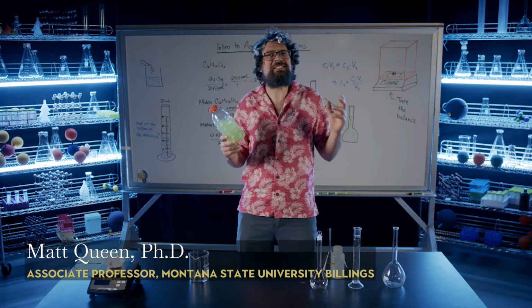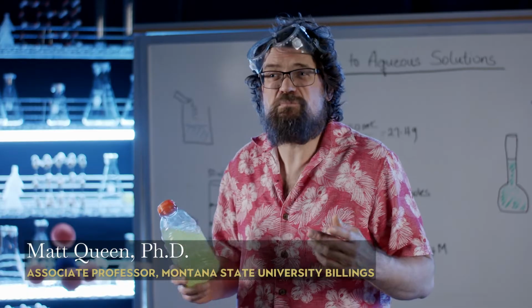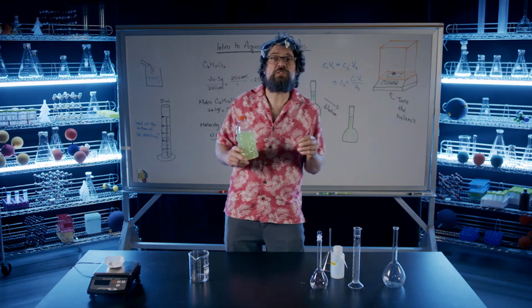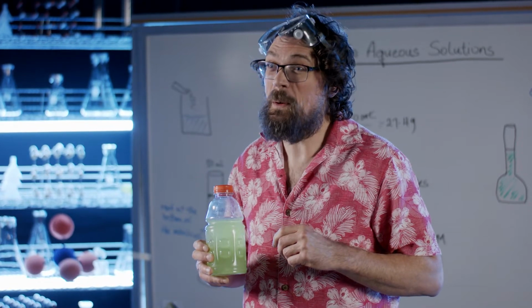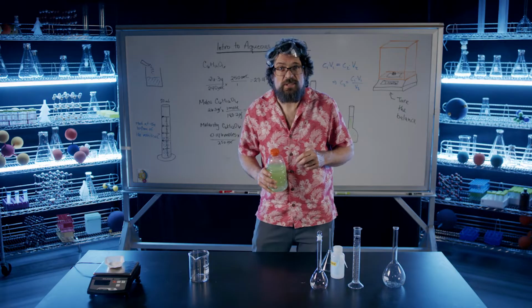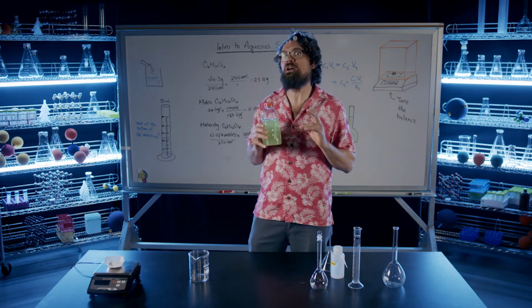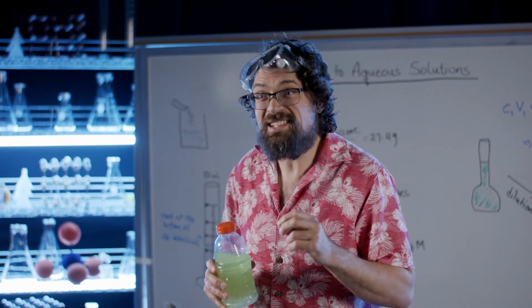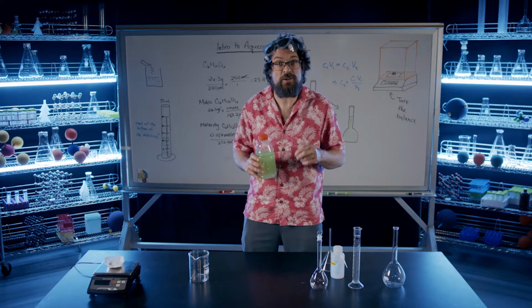Sports drinks are essentially just solutions of sugar and electrolytes, with some flavoring and coloring thrown in to make them less boring. Our university's sports teams use a well-known sports drink that will remain nameless. Let's talk about this solution in chemical terms and see if we can cook up our own in the laboratory. The concentration of dextrose is 26.3 grams per 240 milliliters solution.